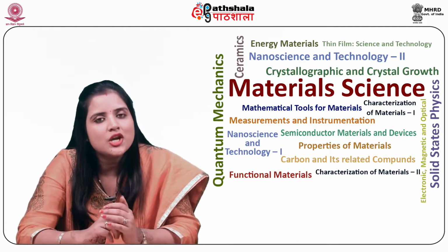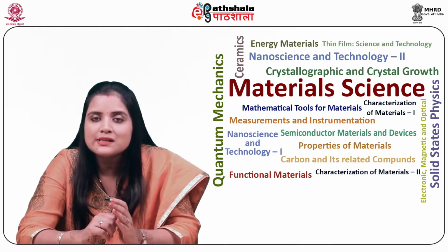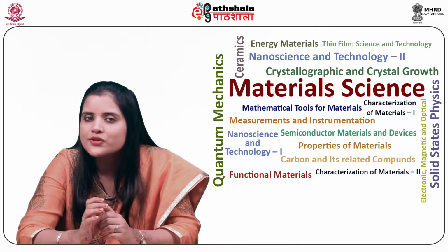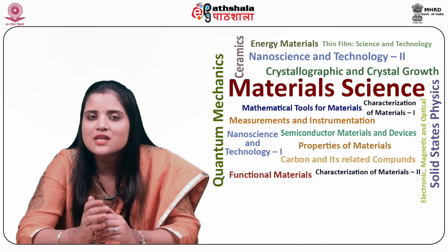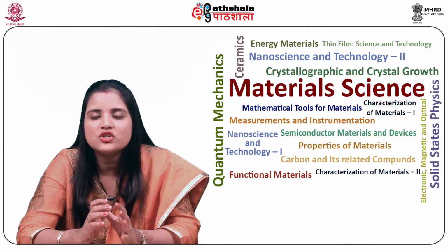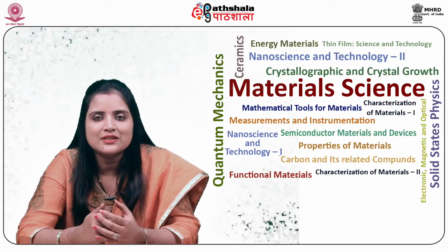So, the suggestion for such problems is that a low vacuum SEM can be used to analyze non-conducting samples, because residual gas molecules present in the sample chamber scatter the high energy electron beam, thereby increasing the analysis area.